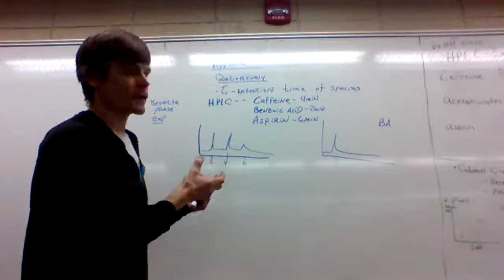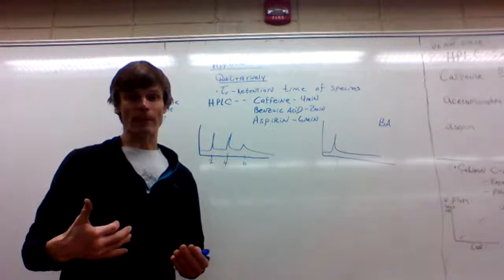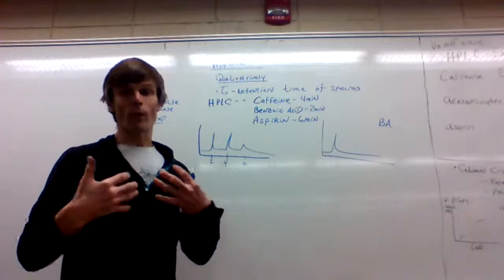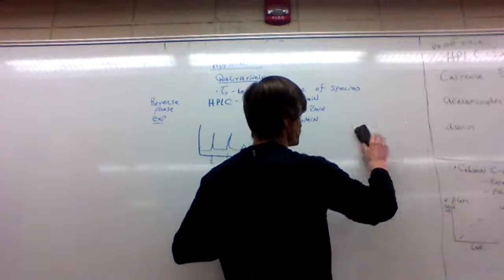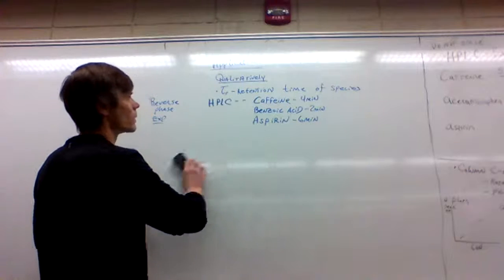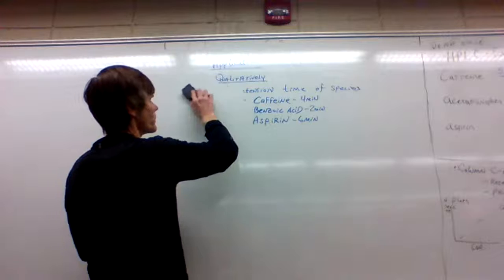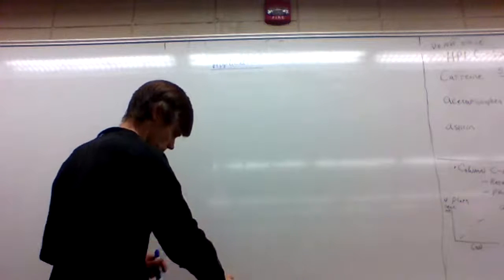So when we conduct an experiment, qualitatively, knowing what the retention times are is really important when we look at a mixture. So that's important for qualitative. And it is important for quantitative.